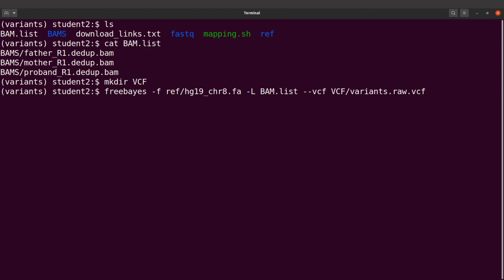Perfect. So this becomes our final command. So let's execute this command. All right. So FreeBayes is working now. It will take some time, so be patient and wait for everything to get done for you.